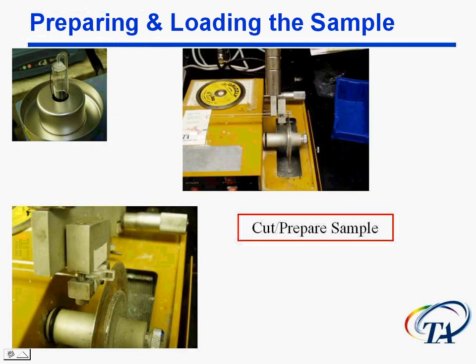Now, our sample itself. We show here a rod of PMMA, polymethyl methacrylate. And we're going to take this and cut a sample of it. And it shows the saw here that we're going to use.